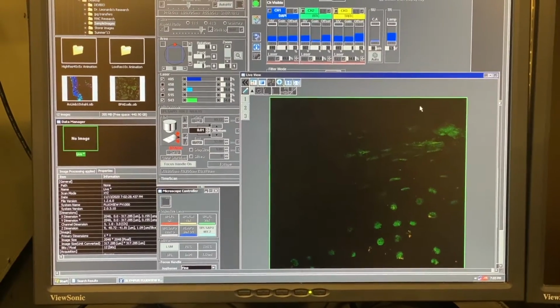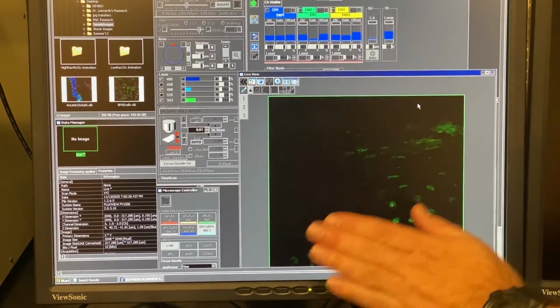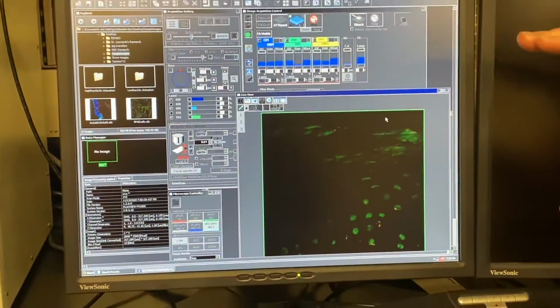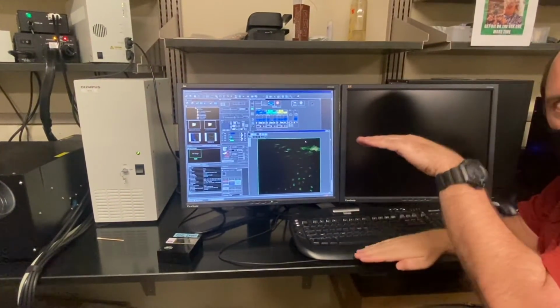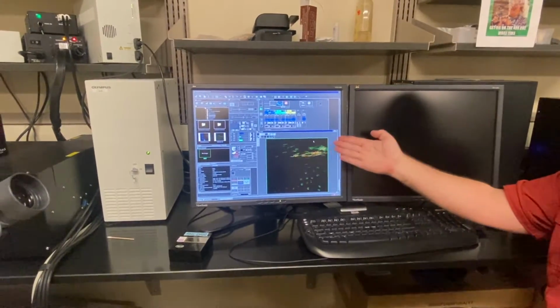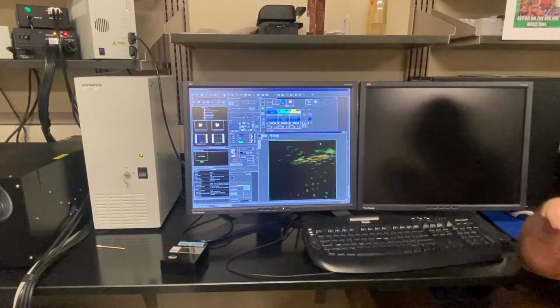Okay, so this is going to take about 10 minutes, so we'll pause and come back, and then I will step you through each of these pictures that it took, just like I stepped you through the top of the pollen grain, the 135 pictures through the pollen grain. We'll have 9 pictures. The second one is already more interesting than the first was. I'll show you those in a second.